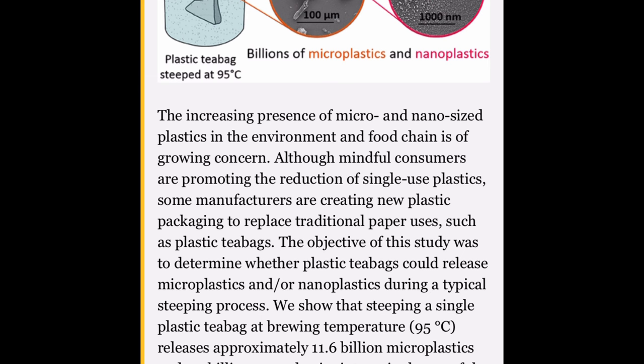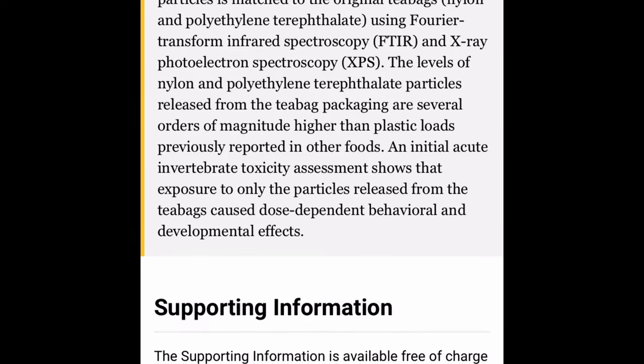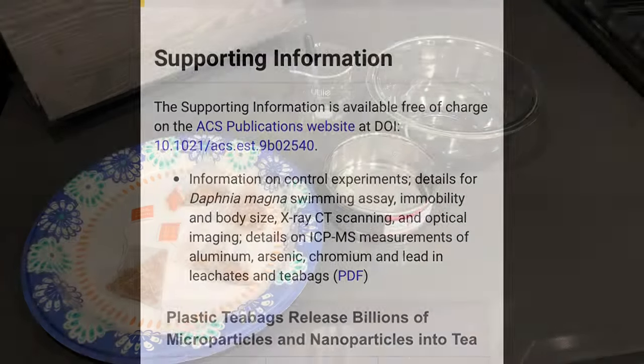Now these guys have access to some way higher powered microscopes than I have, but I figured I'd follow this experiment along just to see what I could find with my compound microscope.